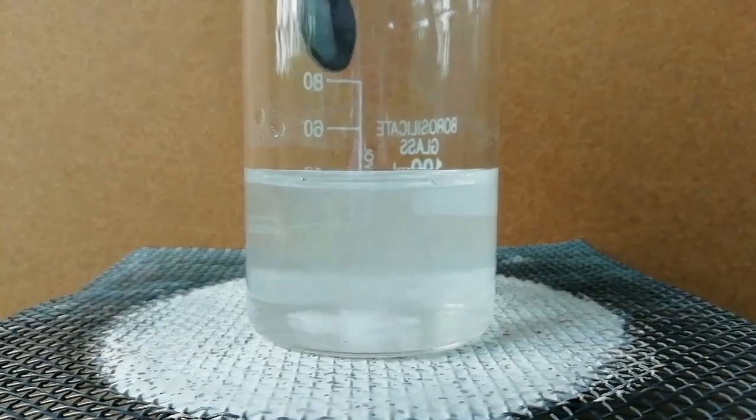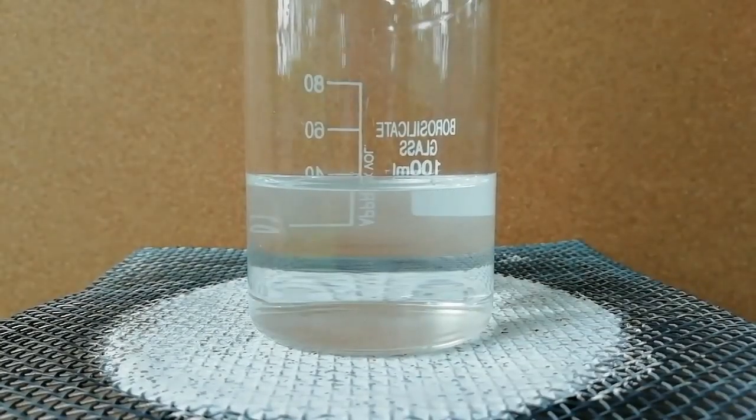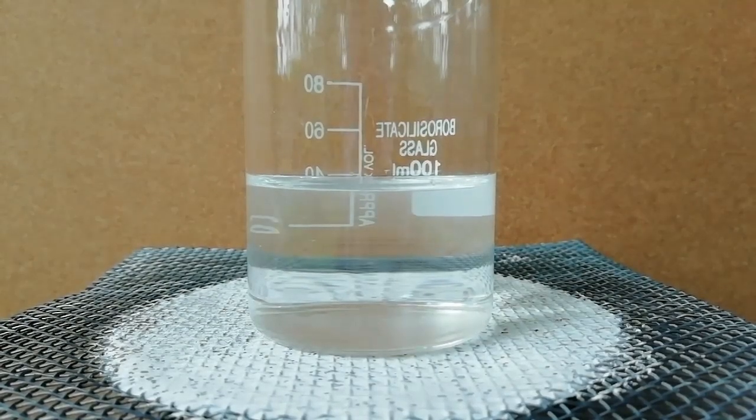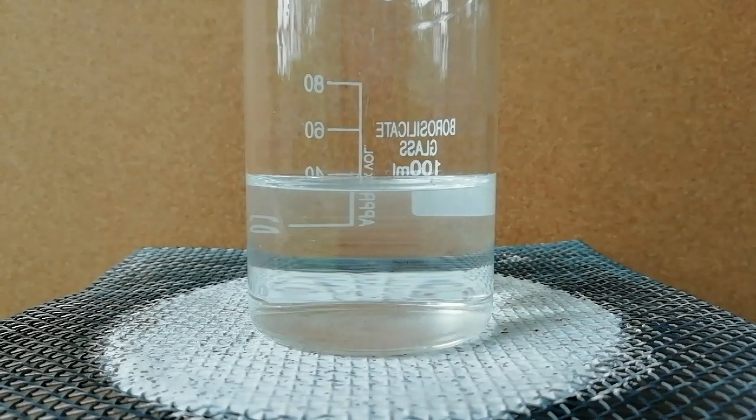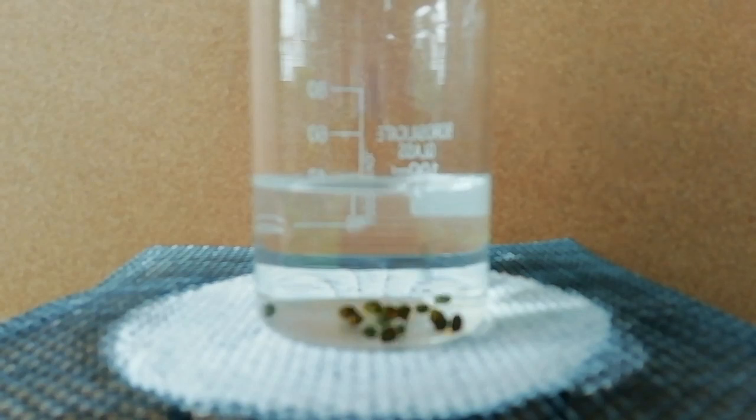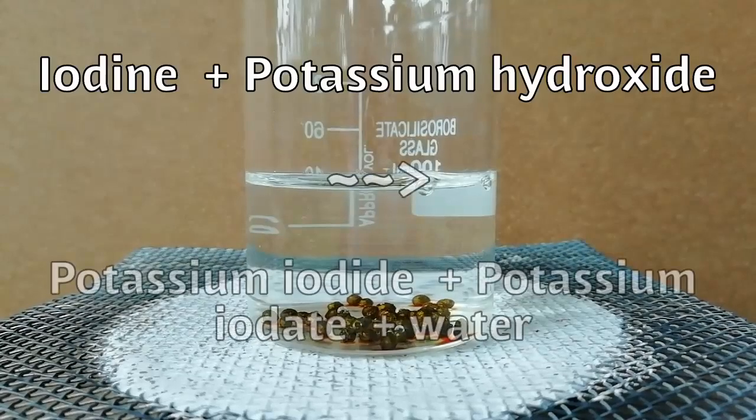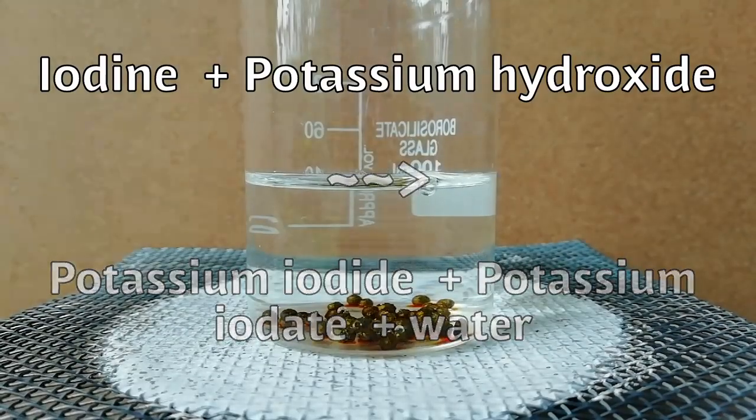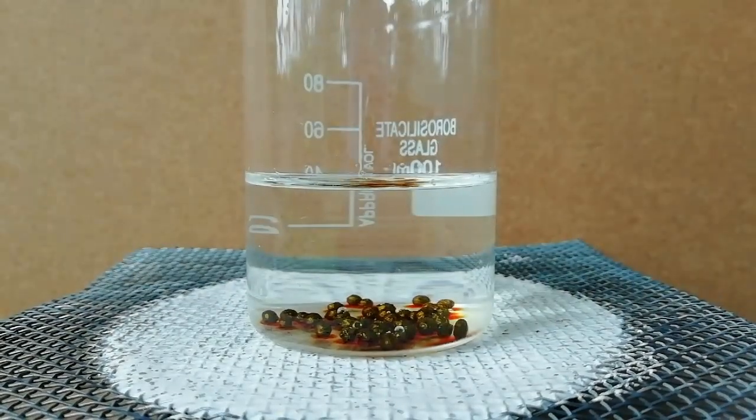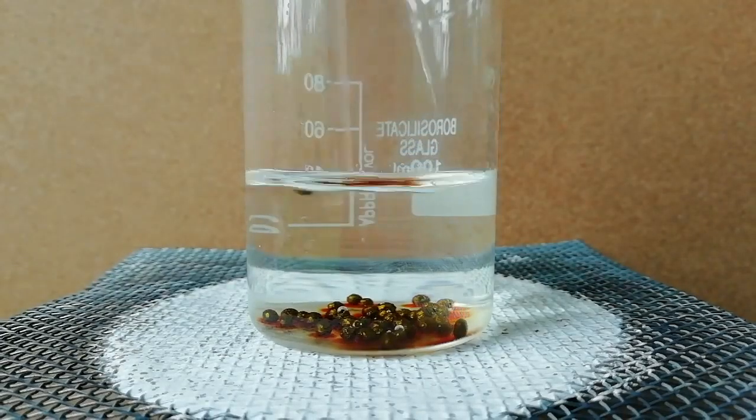Here potassium hydroxide reacts with iodine to produce potassium iodide and water. You can see when iodine dissolved in potassium hydroxide it turned into a slightly yellow color solution.